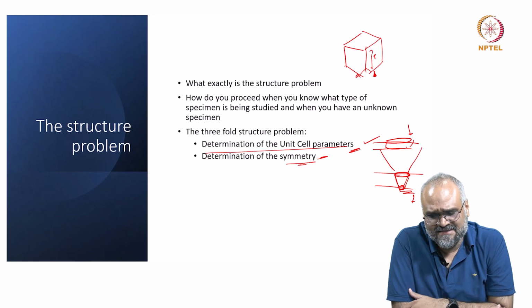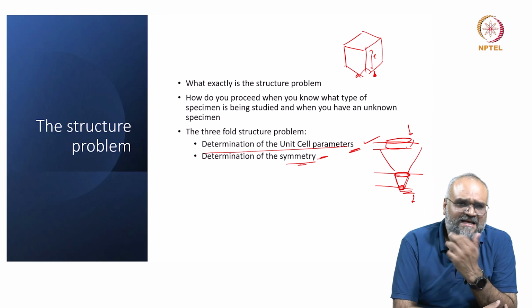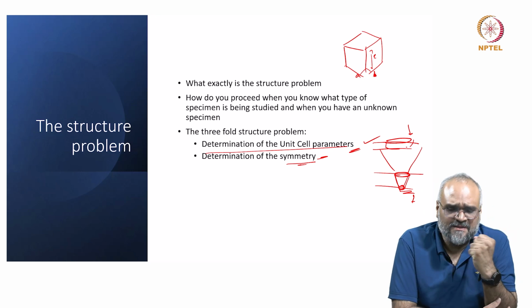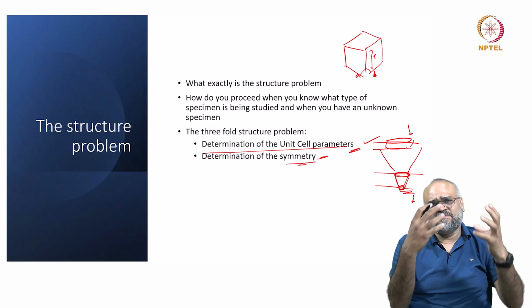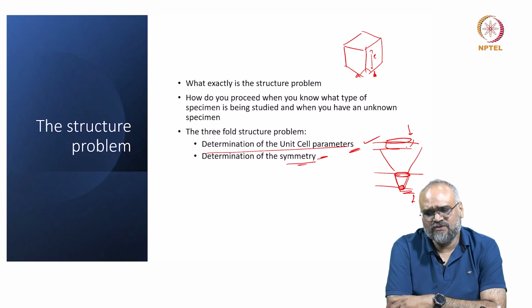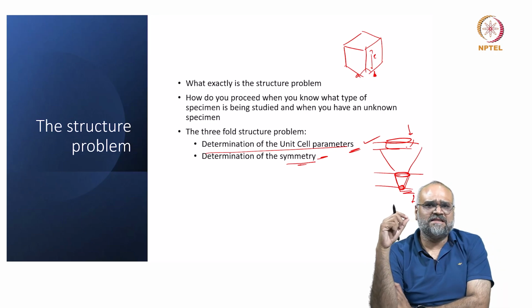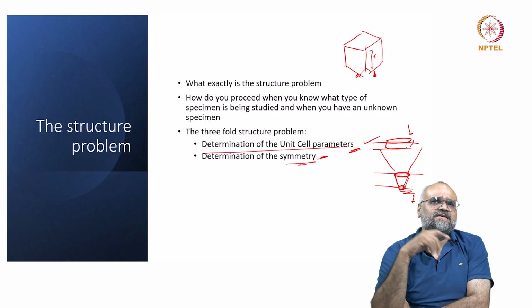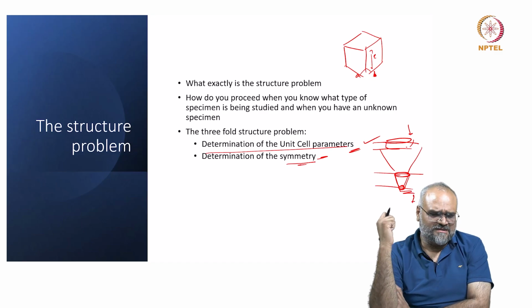And the third thing is, how do I know where these atoms are sitting within a unit cell? In the X-ray and neutron diffraction community, there is something called Rietveld refinement, where you assume a certain crystal structure model, and then you see, by placing or displacing the atomic positions within this crystal structure, how my intensity distribution varies, and I can converge towards a solution there.